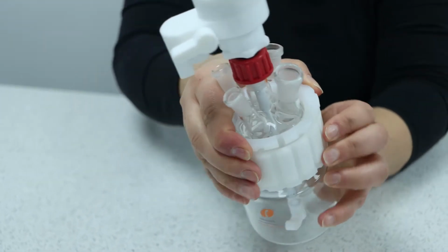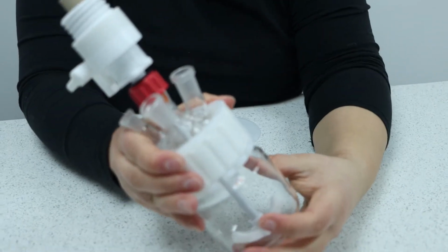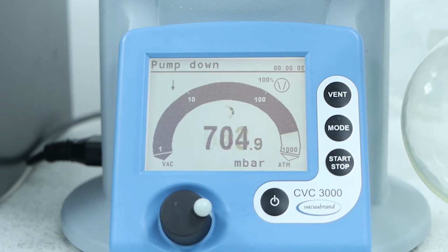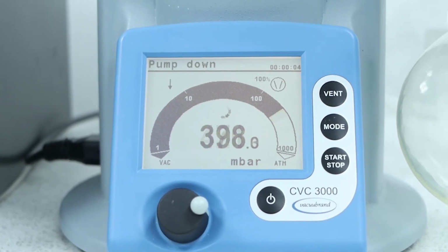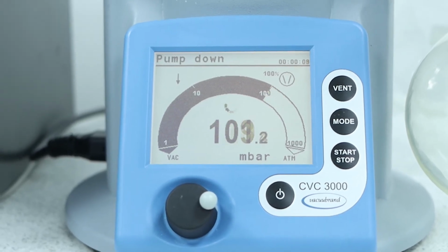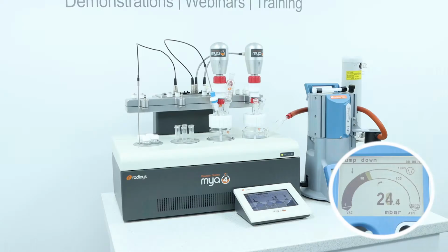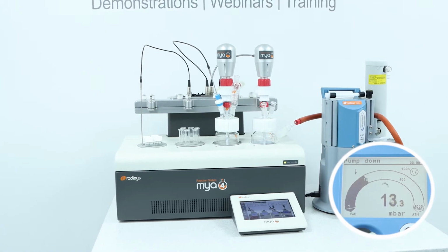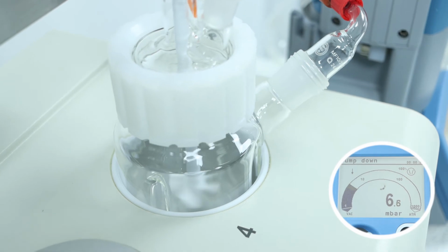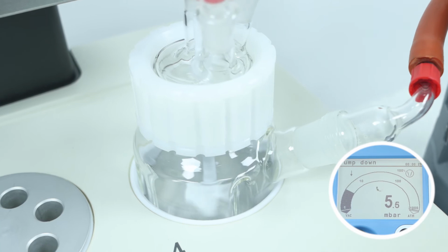A good way to show you the tightness of the seal of the Mya 4 vessels is to apply vacuum. Let's put this Mya 4 vessel assembly to the test. The Mya 4 vessels are designed to go down to about 10 millibar of vacuum. And there you have about 5 millibar.